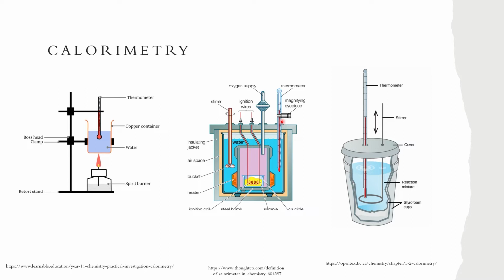Now, when we're doing enthalpy of neutralization, these methods don't make as much sense. We're probably going to be using a calorimeter, which looks a lot more like this. So we've already tried to do some calorimetry using a setup like this one, when we were dissolving different kinds of substances and measuring the enthalpy changes that were there. Very similarly, we're going to be putting all of our chemicals together in the one container and measuring the energy changes in the water. When we were dissolving, we were doing energy changes in a solution. Same thing here when we're doing our neutralization reactions. Everything's going to be in the same solution, so we can use a much simpler setup like this one.